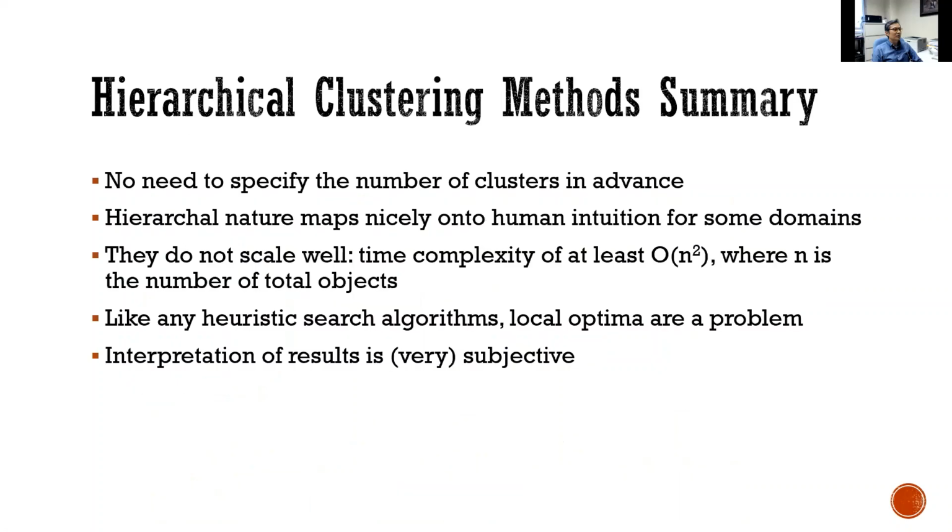The problem with applying this hierarchical clustering algorithm to single-cell study is that it's computationally intensive. It requires a long computation time for a large number of cells. Also, the results are not so easy to interpret. For example, you don't know which level you want to cut the tree to separate the cells into groups.